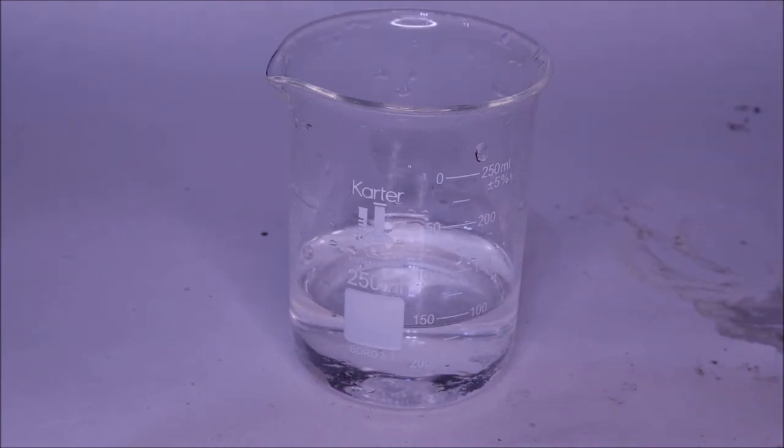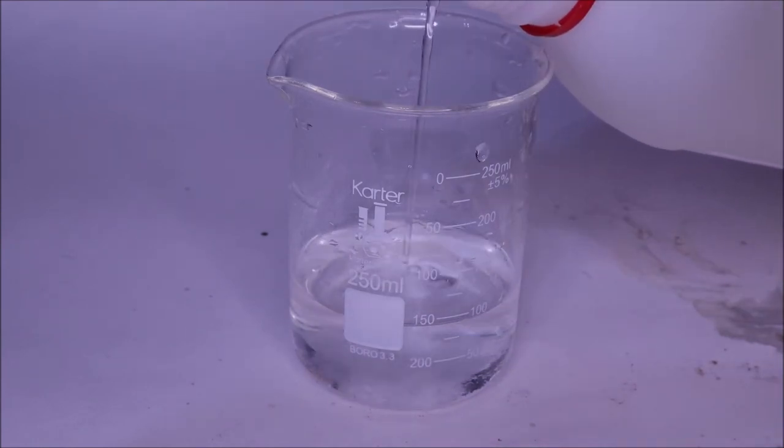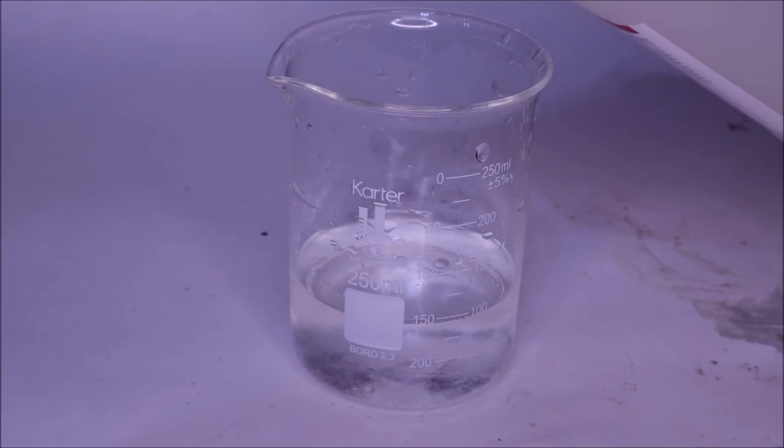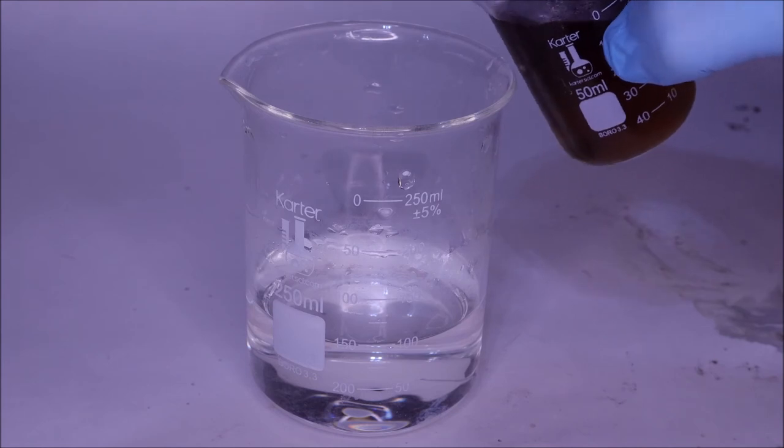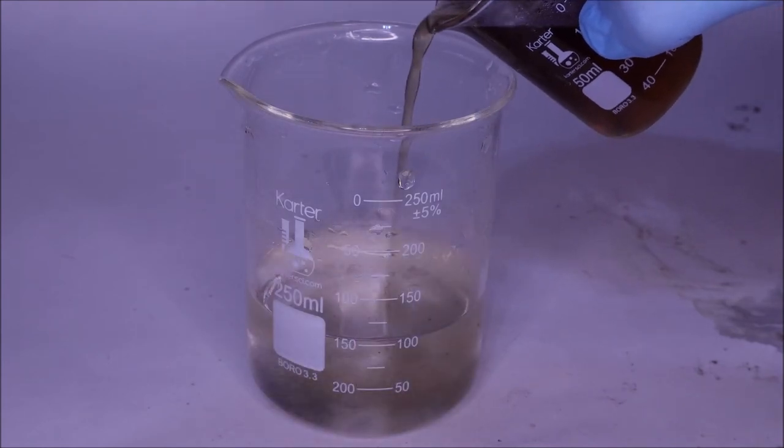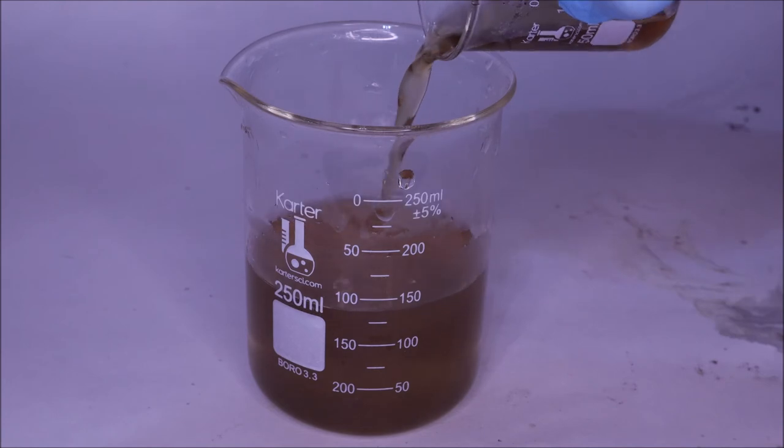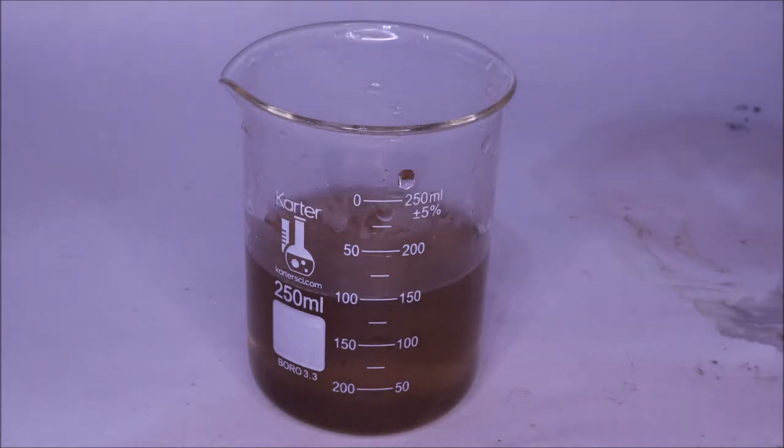I then prepared an acidic solution to add to the bottom layer in order to try and protonate those amino acids back to their acidic forms. When I added the brown bottom layer, well it looked about the same as it did before, which is kind of what I expected.